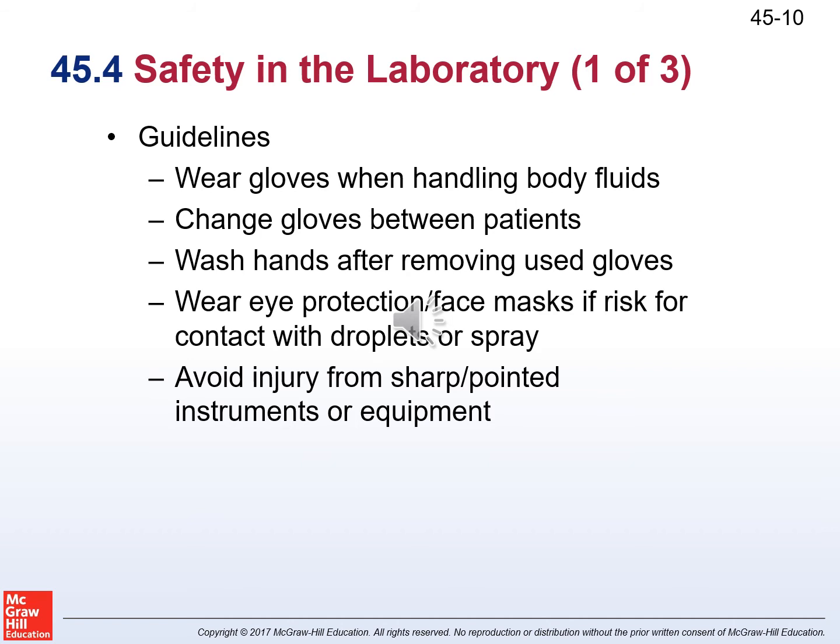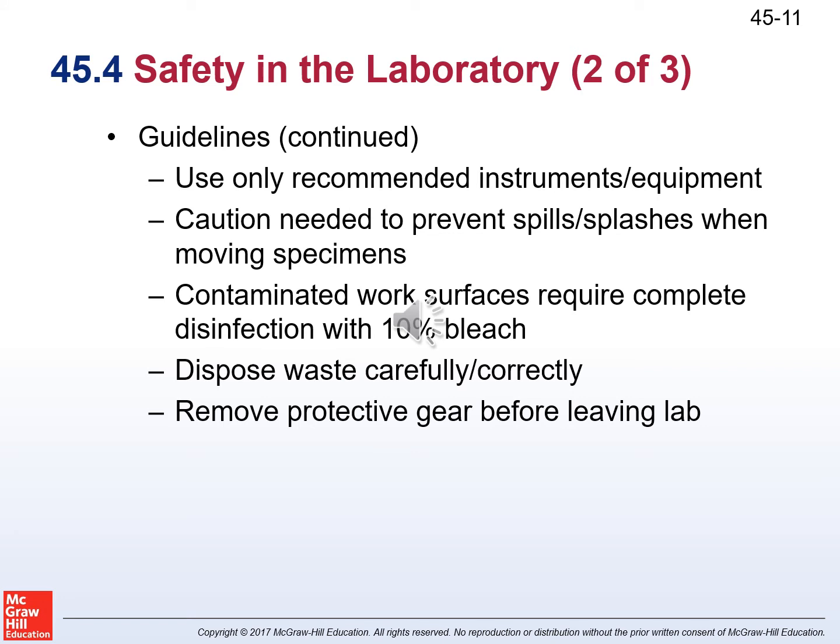45.4, illustrate measures to prevent accidents. Safety is a primary concern in any laboratory environment. Awareness and observance of all laboratory safety guidelines is stressed. Use standard precautions when handling all body fluids, excretions, and secretions.